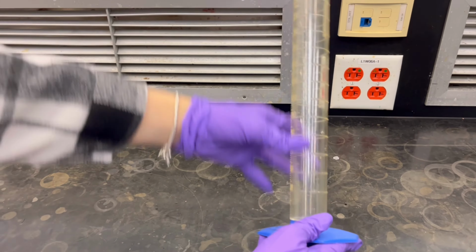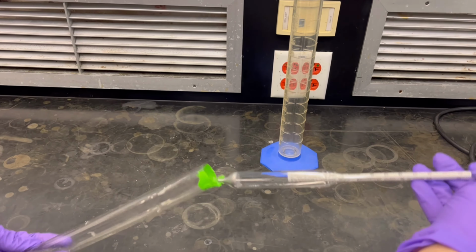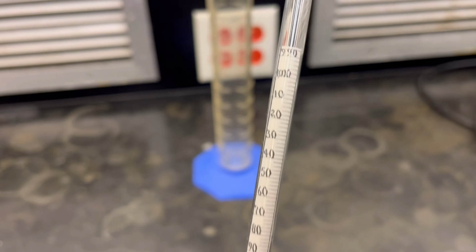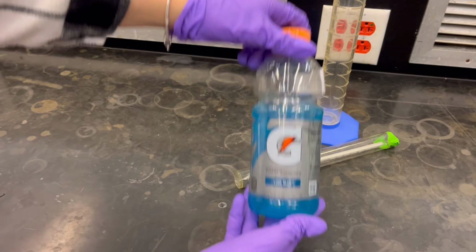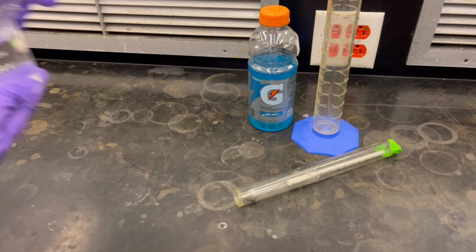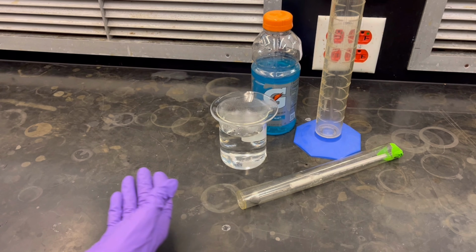For our last part, we will need a 250 milliliter graduated cylinder, our hydrometer, which you can read from this part, and we'll be needing Gatorade and our decarbonated soda that we had from part A. Now we can measure the specific gravity for Gatorade and our decarbonated soda as in the part before.